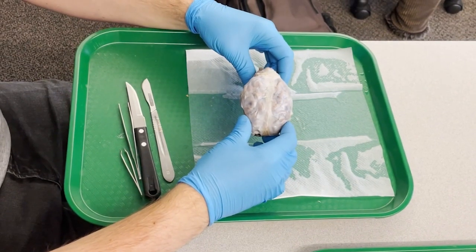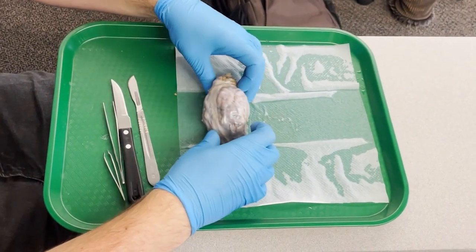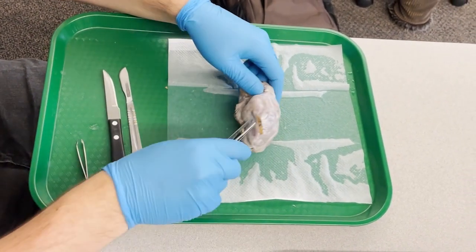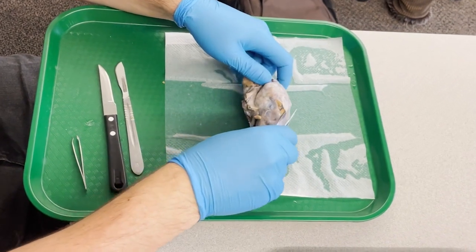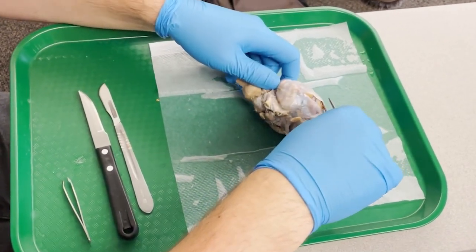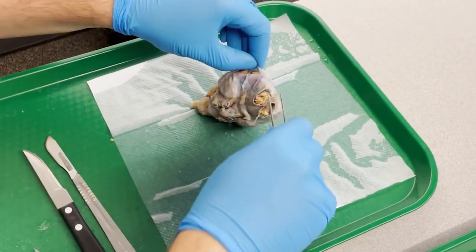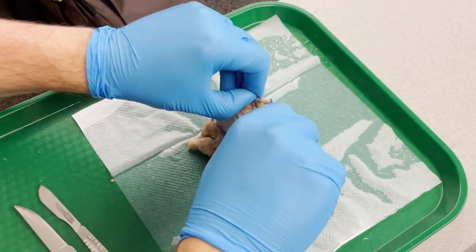All right, so we have our full brain here, but we do have the dura right here. It's kind of peeling up a bit. You can kind of see a slice that was taken out of it. And so this right here, this thing I'm trying to pull up, is a very intact dura.